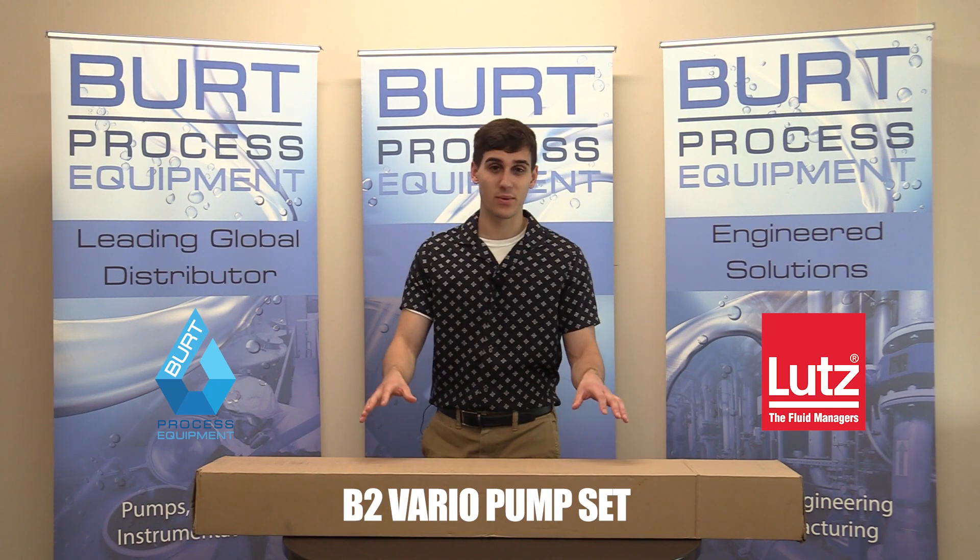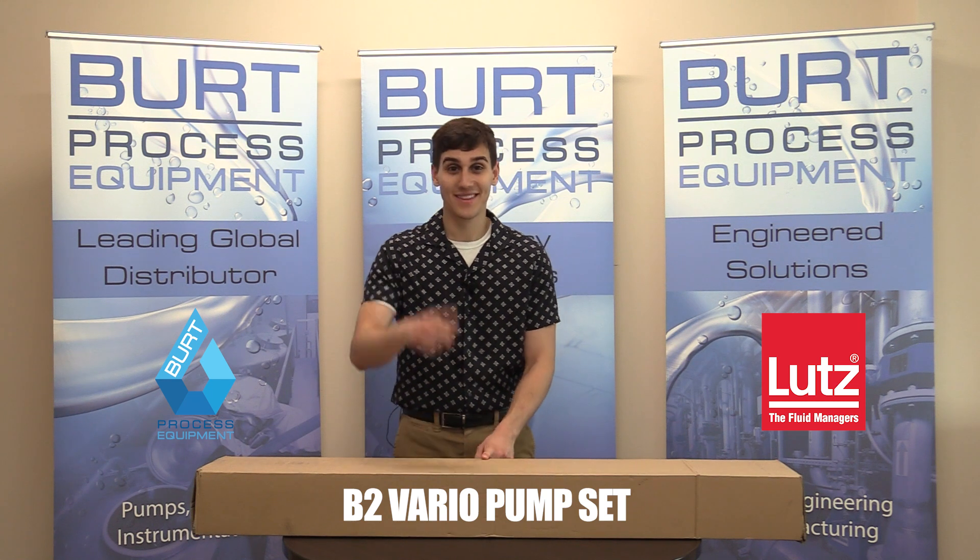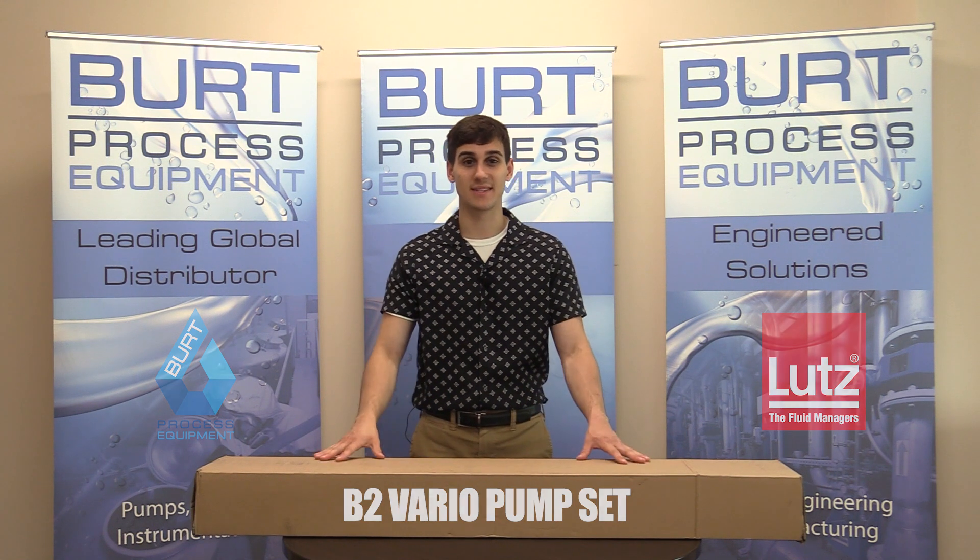What's going on everybody? We're back today with another great product unboxing. Today we have the Lutz Drum Pump Set. Let's get to it.